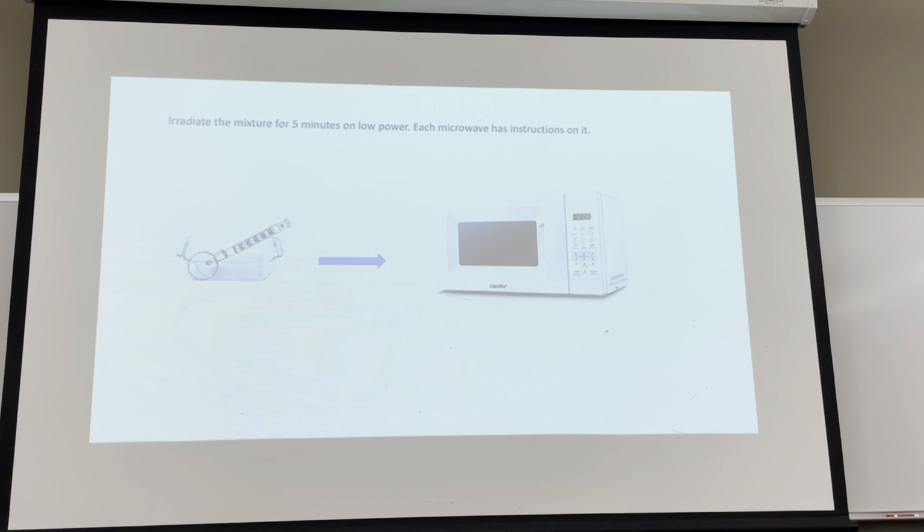Because if you think about it, what you've got in the flask at that point is your ester, which you want, and a whole bunch of acetic acid because you used a large excess of acetic acid. So you've got to get rid of that excess acetic acid that you don't want. And the way we're going to do that is by washing with large amounts of sodium bicarbonate.